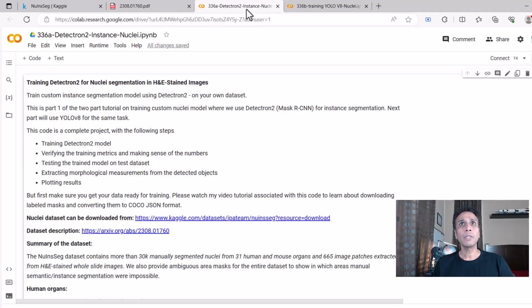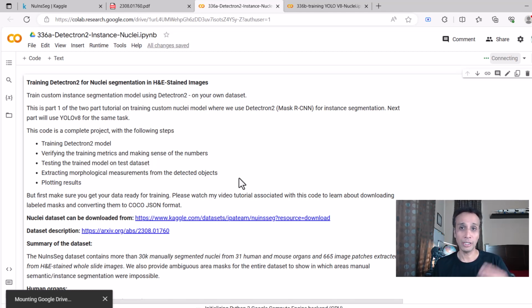And let's start with our Detectron model, and let's go ahead and connect, and hopefully GPU is available. I have been using it all day yesterday, so I hope Google is not mad at me. I had to stop my work a few times because I'm using the free version, and I reach a certain limit and it's like, okay, you can't use it. And the day after I try and still I can't use it. But I hope we don't run into something like that during this recording.